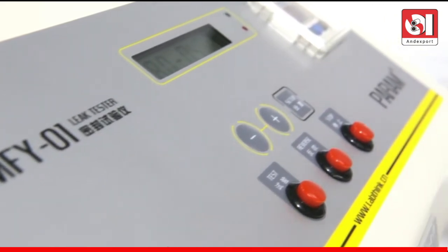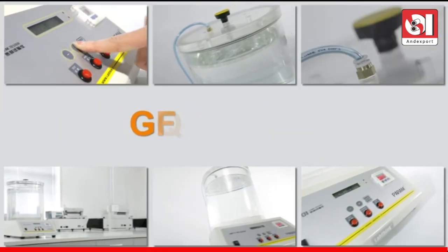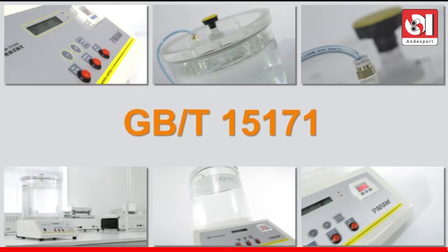The testing principle complies with ASTM D3078 and GBT15171 standards.